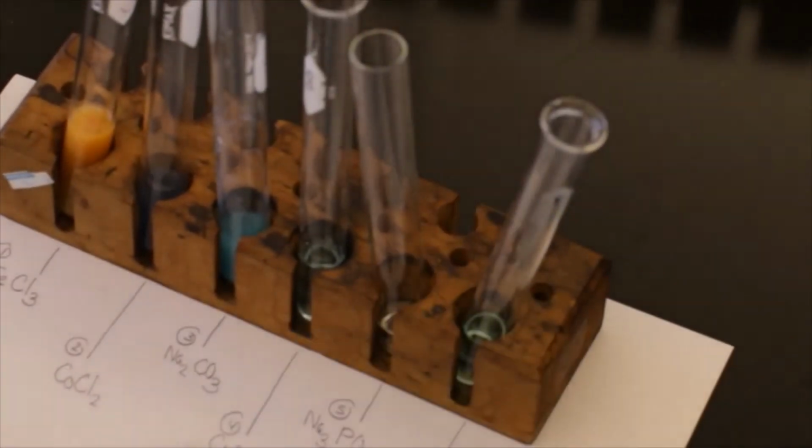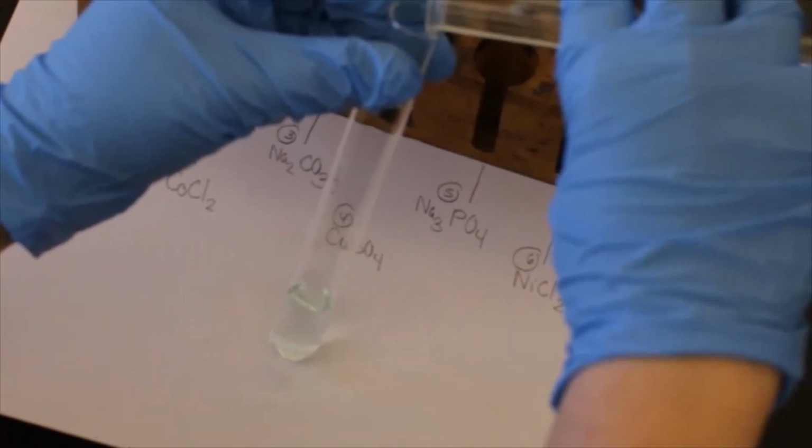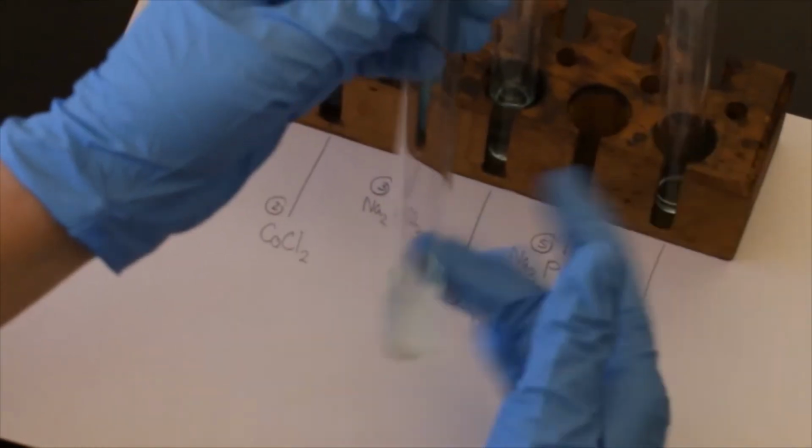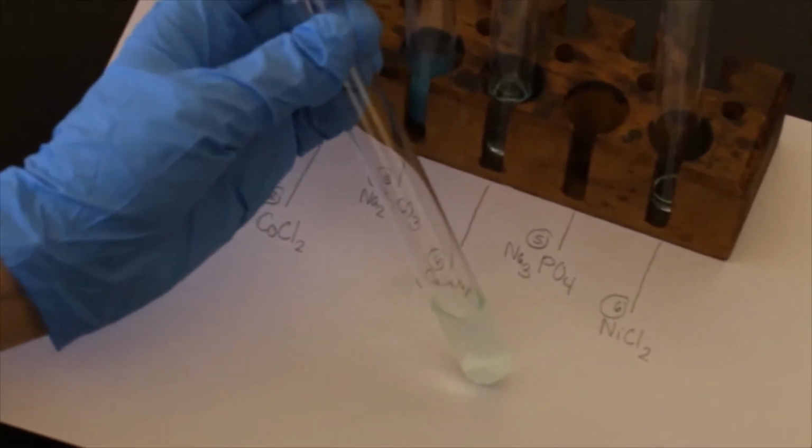Okay. So now that leaves us with the last one, which is E, and it asks us to transfer half of the nickel chloride into our Na3PO4. So we're going to add our light green into this and see what happens. And when we add, again, no real reaction, still stays that green color. Similar to this, just an increased volume.